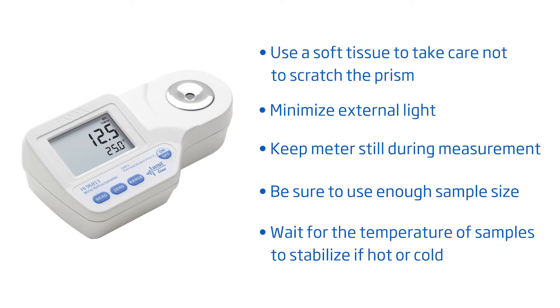To take measurements, simply add sample and press read, taking care to cover the prism if there is strong light. Here are some tips for best results: take care not to scratch the prism, minimize external light, don't move the meter during measurement, make sure to have a sufficient sample size and no bubbles on the prism, and wait for the temperature to stabilize if your sample is hot or cold.